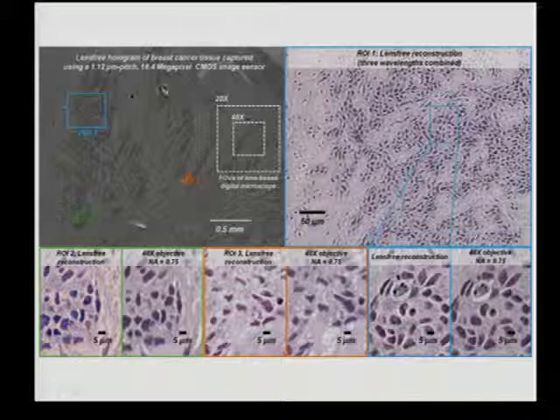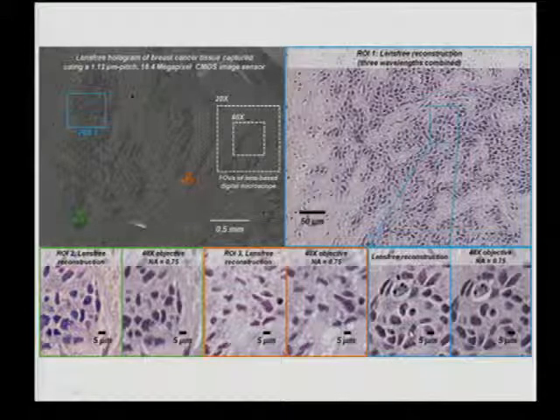What you're looking at here is a tissue sample, about 20 millimeters square field of view. And you can zoom in to our reconstructions that show you how it compares with a traditional light microscope for all these features. It's quite interesting. In this case, the colorization is coming from individual sequential illuminations at different red, green, and blue wavelengths. Because this is holographic, it's more convenient for us to do colorization after 3 sequential illuminations.